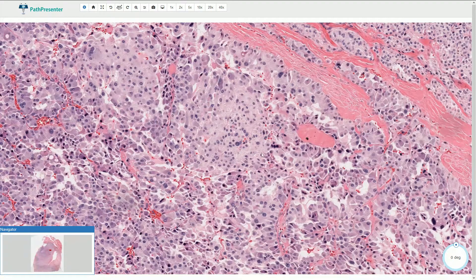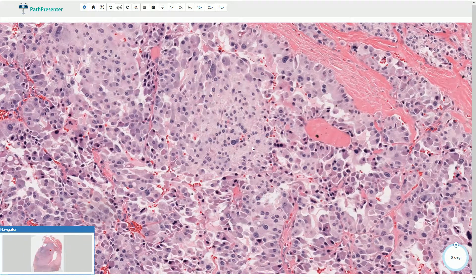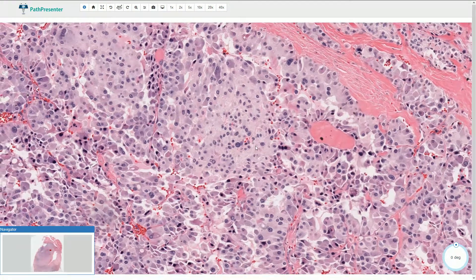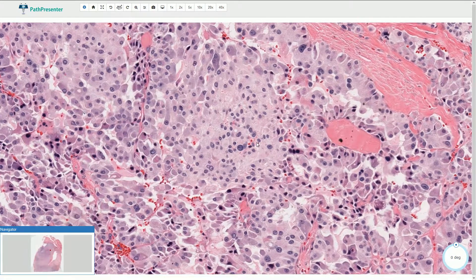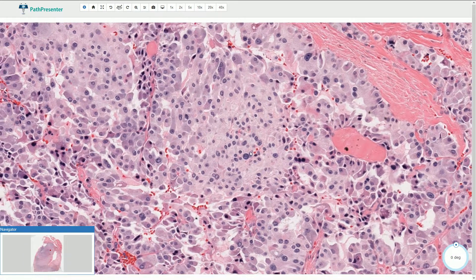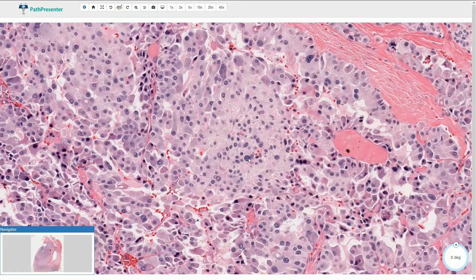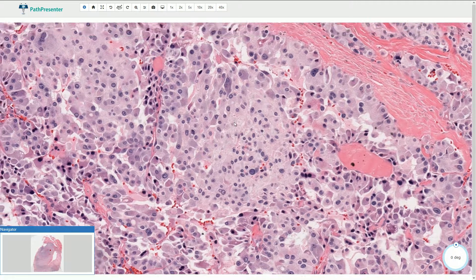The neoplastic cells are basically neuroendocrine cells, so they have the classical nuclear features of neuroendocrine tumors, which means we can find stippled chromatin or salt-and-pepper-like chromatin in the nuclei, and small inconspicuous nucleoli.